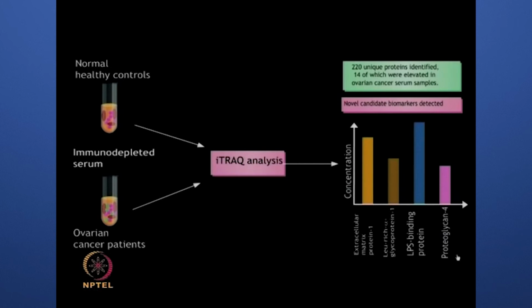These results were further validated by Western immunoblotting. This just gives you an overview of how iTRAQ reagents can be used for various types of applications, including biomarker discovery.